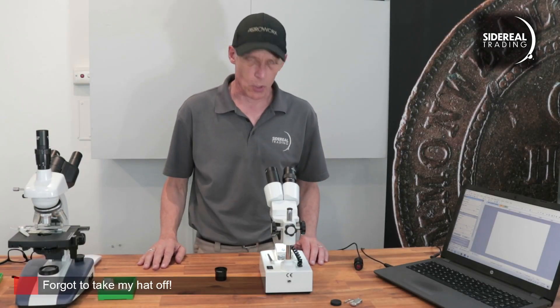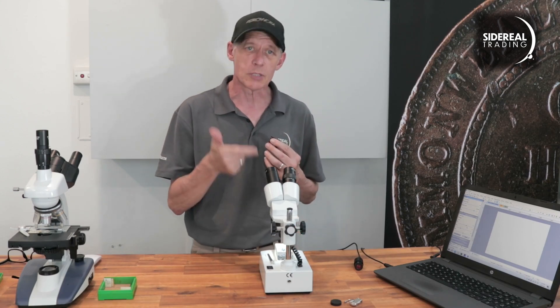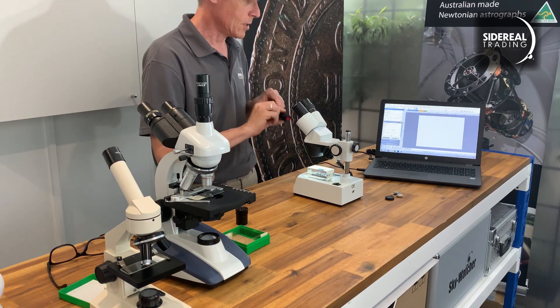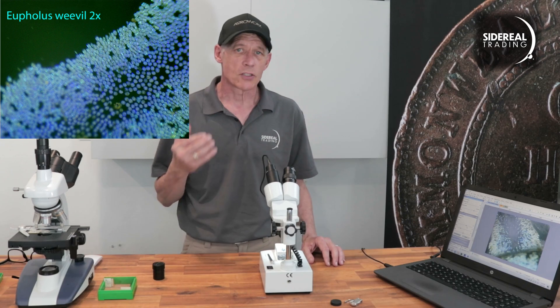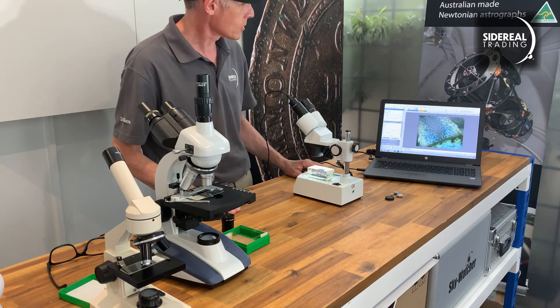Our final microscope is a stereo model. These are more about large specimens and you can use them for dissecting — kids love them because you can stick your finger underneath and get a good close look. This time we're going to need the 30.5 millimeter adapter for the camera, because that's the diameter of the eyepiece on this microscope. We remove the locking screw, lift out the eyepiece, drop the adapter in, and the camera goes straight in. There's our Eupholus bug on the screen. You can frame it, adjust the focus, exposure, and all that. You could probably use this setup with two identical cameras to generate a 3D image of the specimen — good for presentations or teaching. You'd need a fairly flat object though, because the depth of focus is fairly narrow on microscopes.